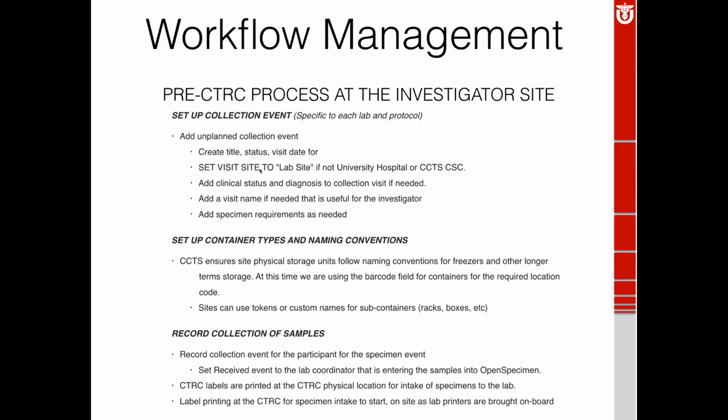That's more of an administrative management report, but it also helps us with knowing what freezers are in what place. Maybe there's a building that has power issues and things like that, and so folks can sort of plan for whether or not they can put more freezers in one building or not, that sort of thing. Of course, you can do that all manually now, and most labs just can tell you what they are, but it's easier to do it if we have a report.